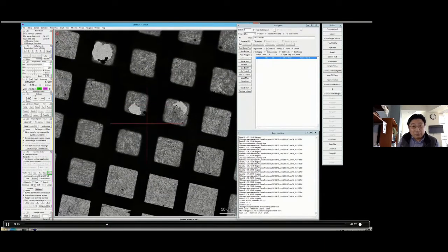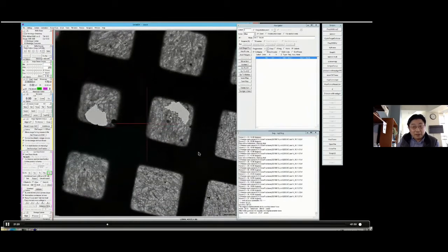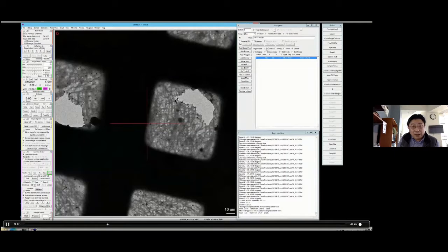So the idea is you select, do a very simple alignment. For example, I see this object, so I add an object, so-called add marker. So the number 2 is this area. Okay, then we want to go there. We go to this place. And this is what I call hole, basically an empty area. So I put a name called hole. And this one you can give a name called marker or whatever.